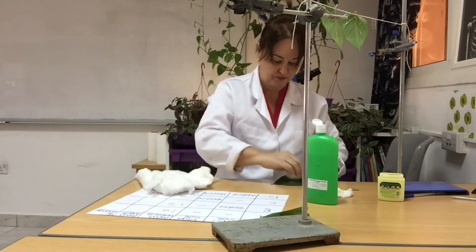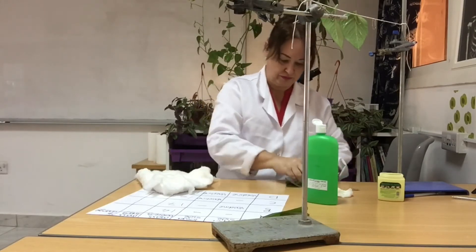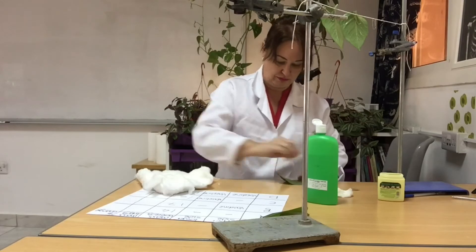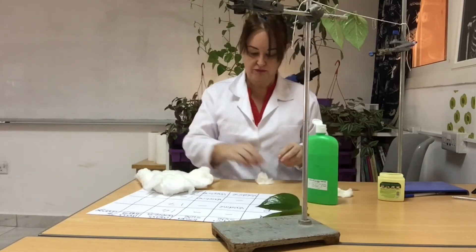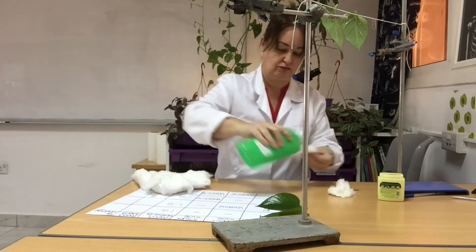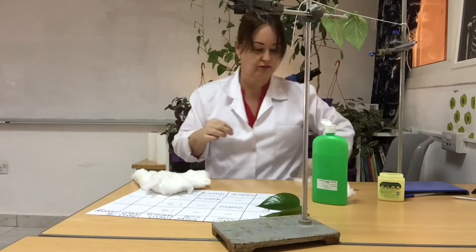I'm rubbing it off with cotton wool. I'm even going to use it on leaf A, which didn't have any Vaseline on it, just to make sure that everything I do for each of the leaves is exactly the same.